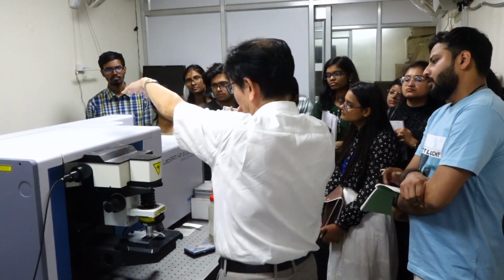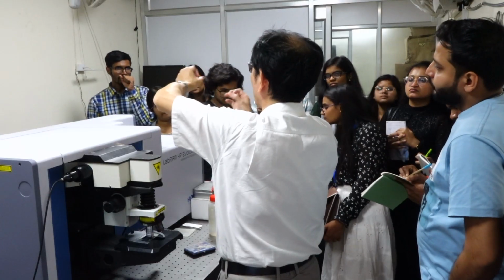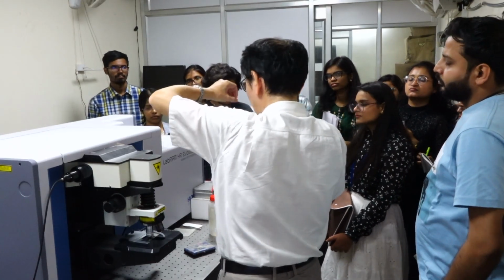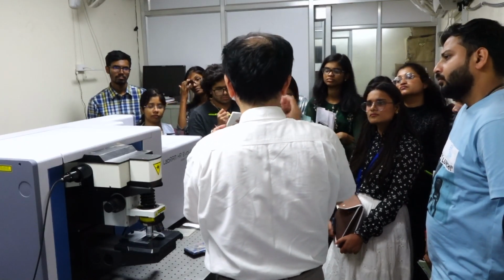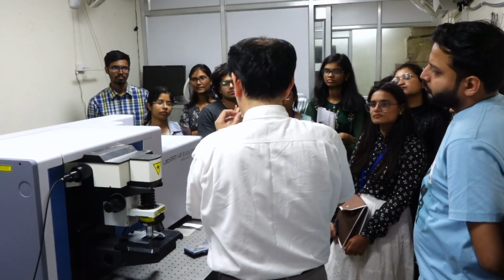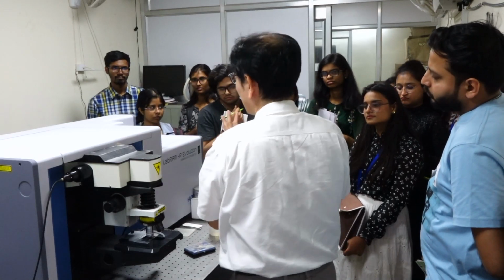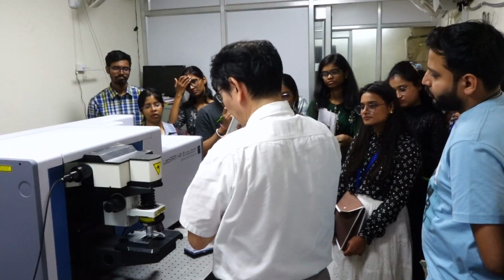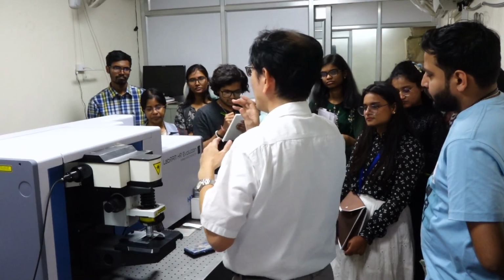Okay? So one photon is converted to one electron in the case of a quantum efficiency of 100%. Typically, the quantum efficiency, that is the conversion efficiency from photon to electron, is less than 100%. But recently, in the visible region, it's up to 80% or so, if this detector is a good one. So that is the Raman microscope. Okay.